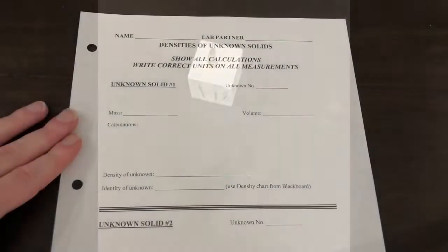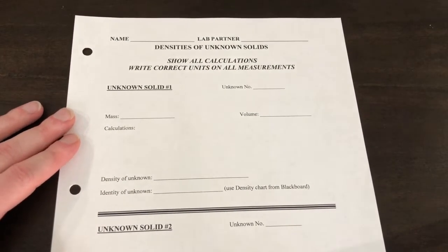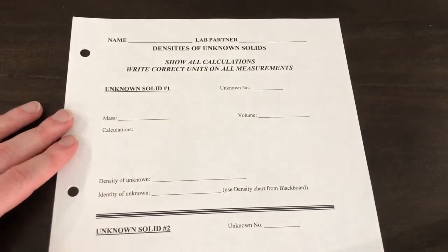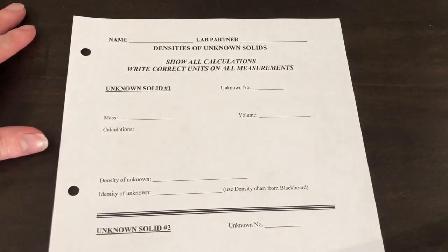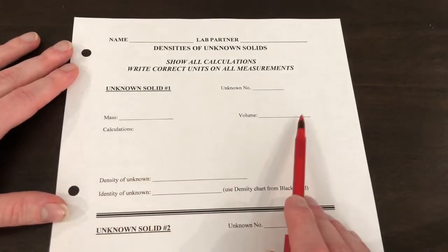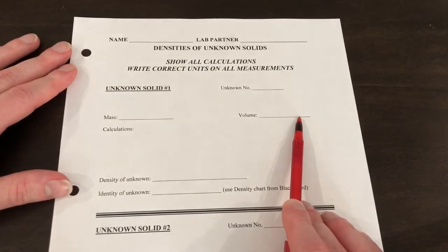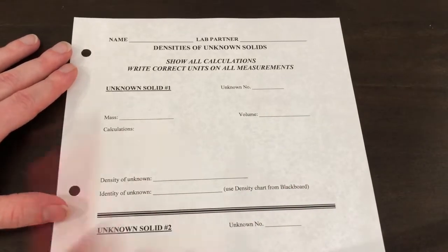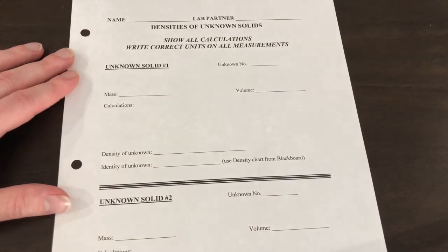Okay, going to our data sheet. Our first unknown solid we're going to write here. It's the silver looking one. Okay, we're going to write our mass here and our volume here. Remember, our volume is found by length times width times height. And our mass we get from the scale reading. Okay, so we can find the density by doing mass divided by volume.